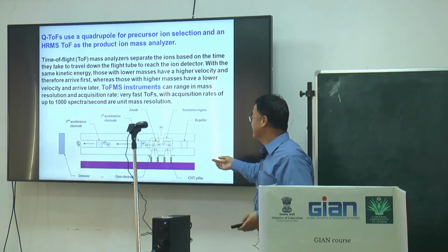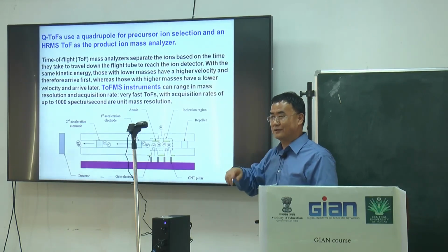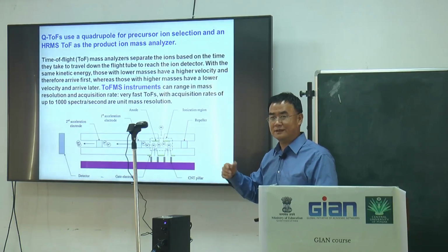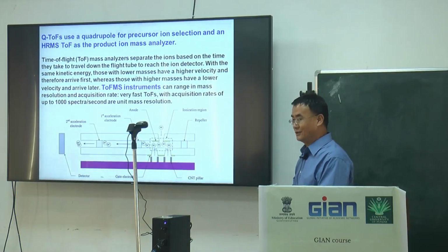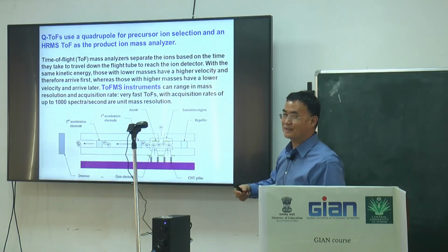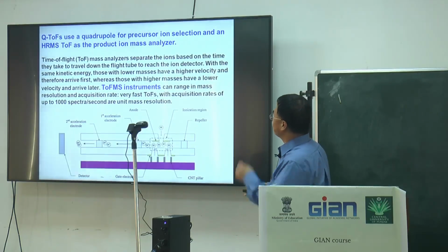But in this high sensitivity machine, 0.5 microliter is enough. The sensitivity is very high, so you don't need to worry that injecting a small amount means you couldn't get the signal. No.